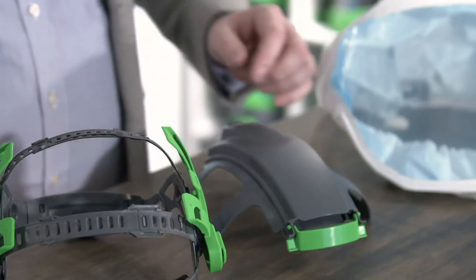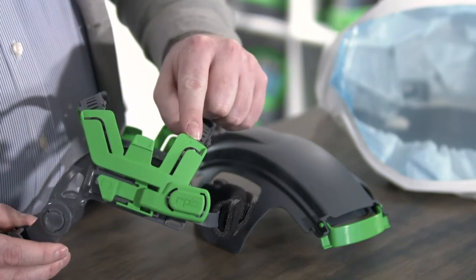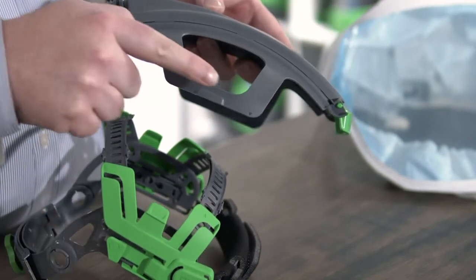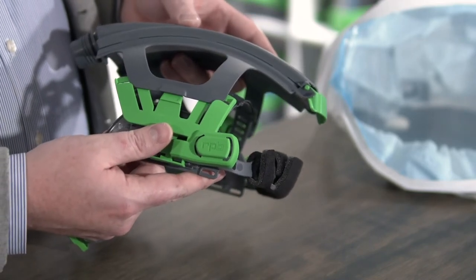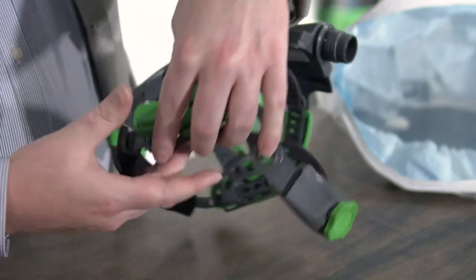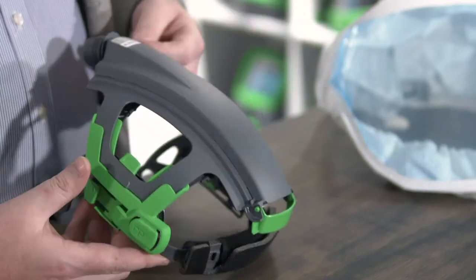First we'll show you how to assemble the head suspension system. On the side of the head suspension you'll notice there are green clips with a small arrow that matches up with the arrow on the air vent. This indicates the orientation the air vent needs to assemble onto the head suspension bracket. Simply line up those arrows, clip it into position on one side, then turn it around and clip it into position on the other side. That's your air vent now secured onto the head suspension.